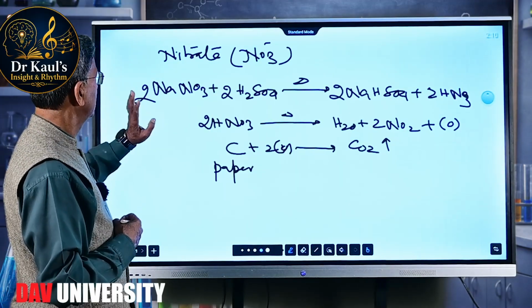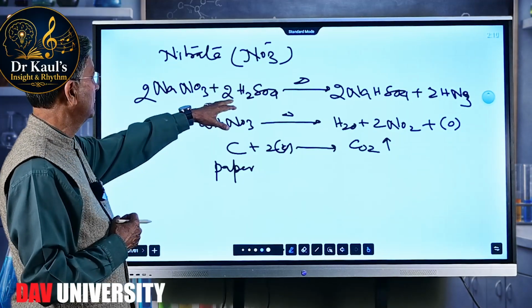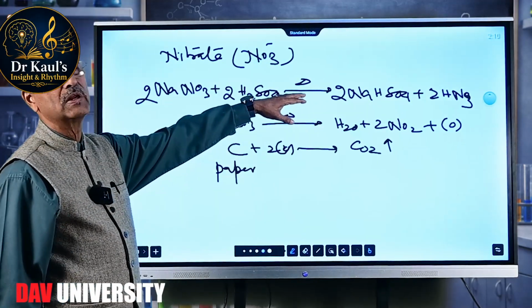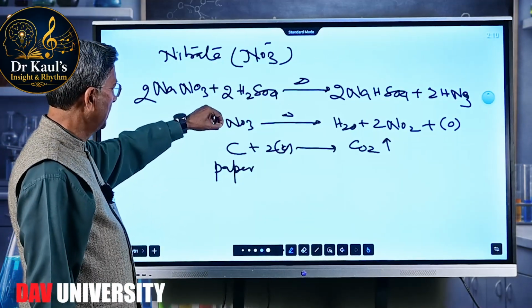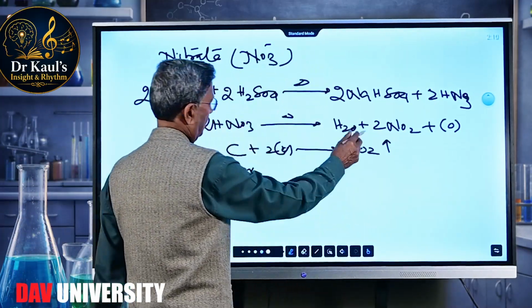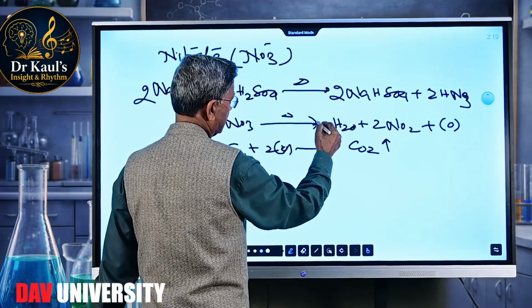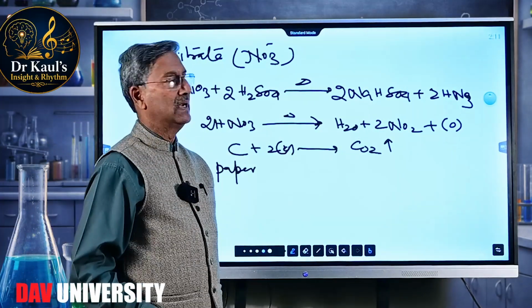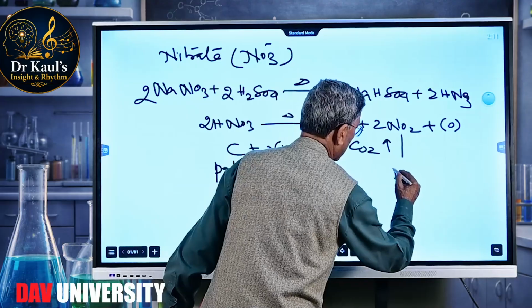So if on heating a salt mixture with H₂SO₄ we get the evolution of a light brown gas, and we add a paper pellet into that, with that this process is made faster and more NO₂ gas is evolved, which gives us a reddish brown coloration.